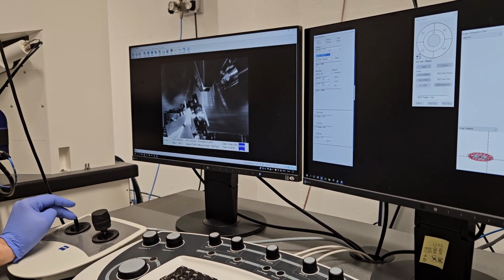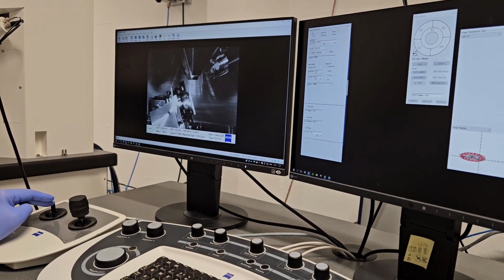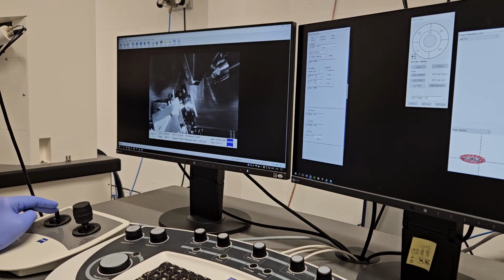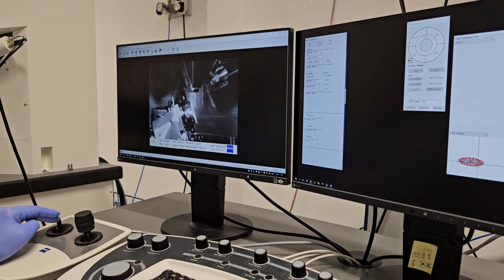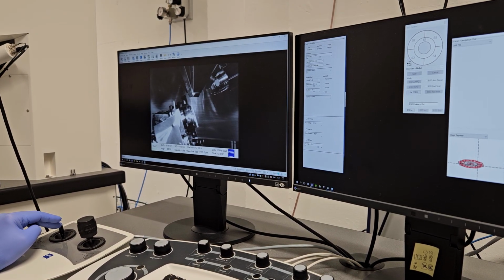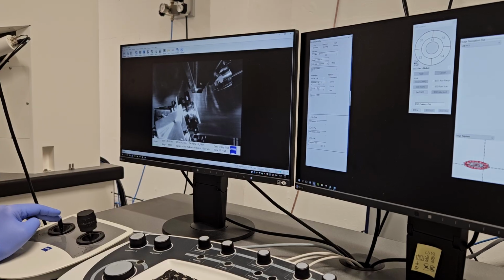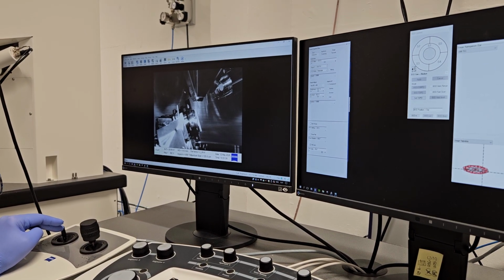So now it's 18.4. I guess it will not be possible to go to 8.5. Don't guess, I know it will not be possible. At least we can get as close as possible. Make sure nothing touches this focus. So that's the closest you can get. Be very careful, okay? Make sure that not this part touches this.